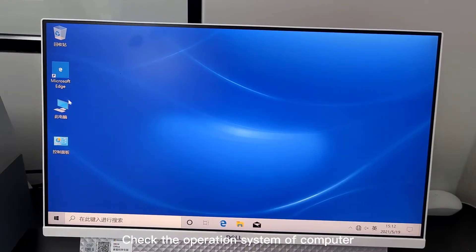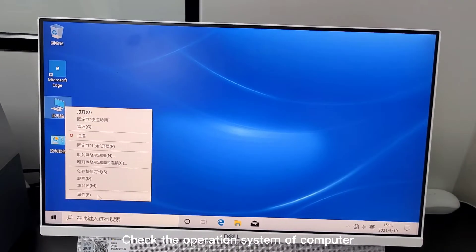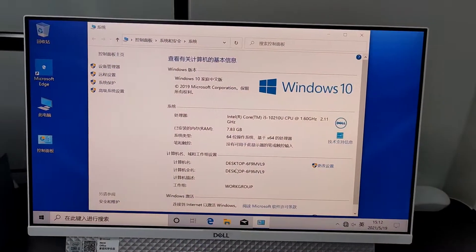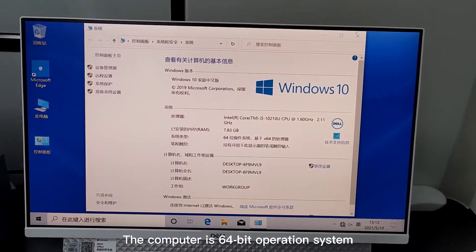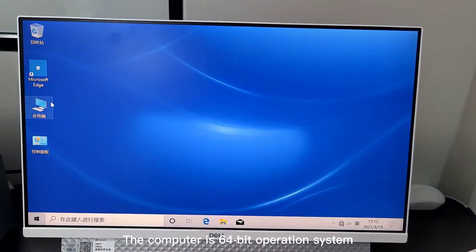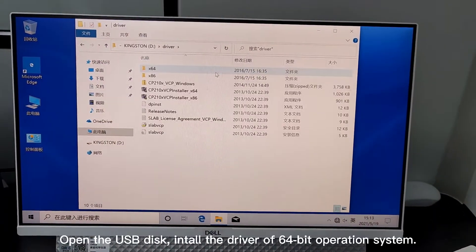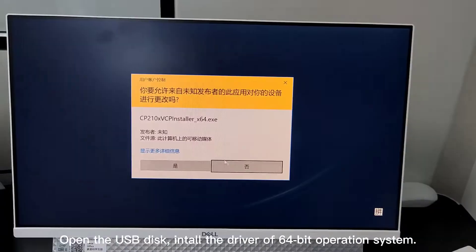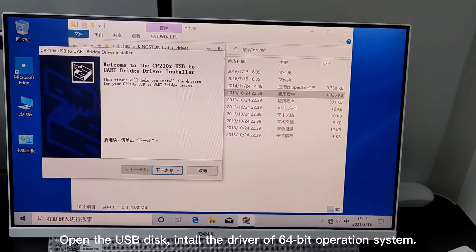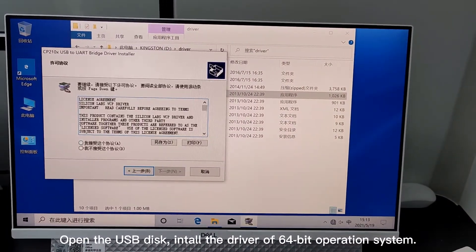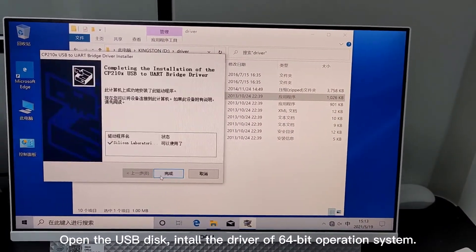Check the operation system of computer. The computer is a 64 operation system. Open the USB disk. Install the driver of 64-bit operation system.